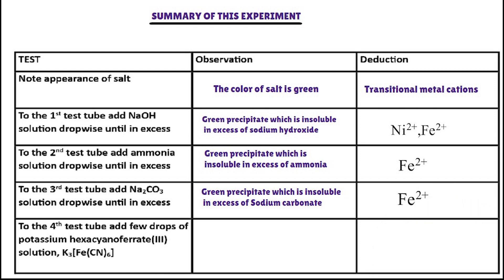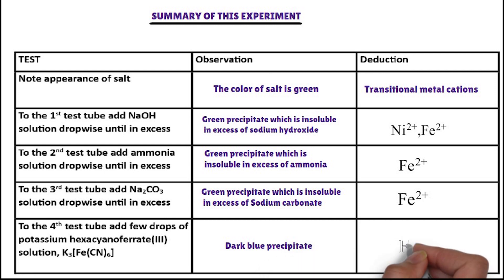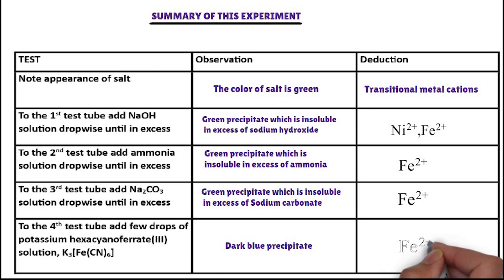Confirmatory test: in the fourth test tube, potassium hexacyanoferrate(III) solution is added. The cation that forms a dark blue precipitate with potassium hexacyanoferrate(III) is iron(II) ion. Iron(II) ion is confirmed. The cation present in the salt is iron(II) ion.